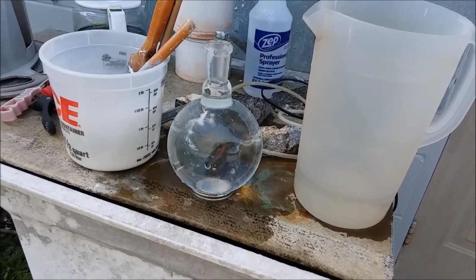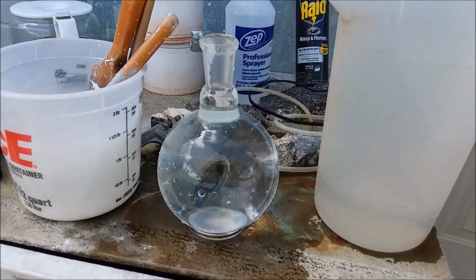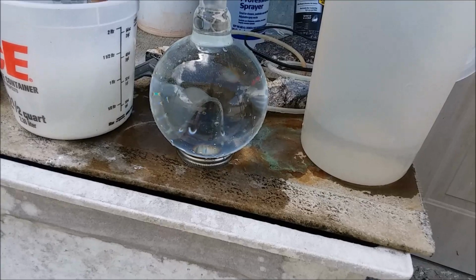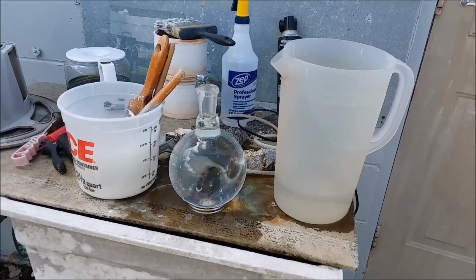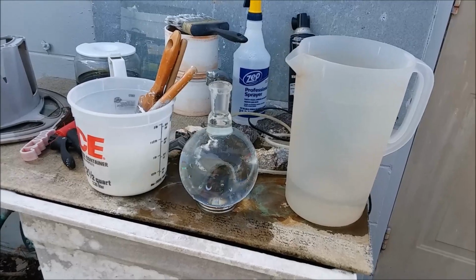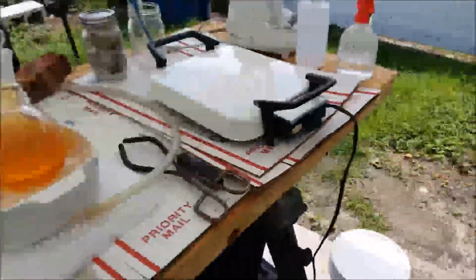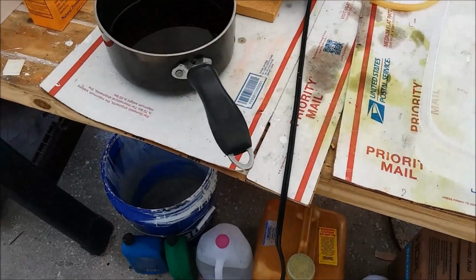Filled it to the brim with hot water after I dumped out all the semi-liquid sodium bisulfate I could. And what was left in there is dissolving before my very eyes. So it's not going to take a couple hours like it normally does to clean that flask. It's going to be clean almost immediately. Excellent. So speaking of cleaning, I need to do some more cleanup work here.